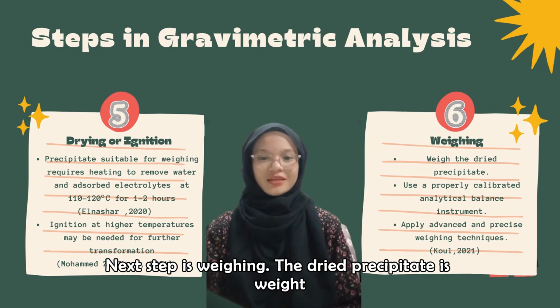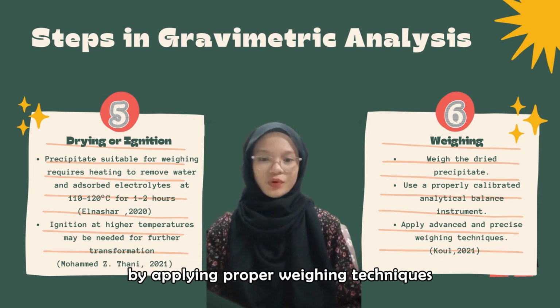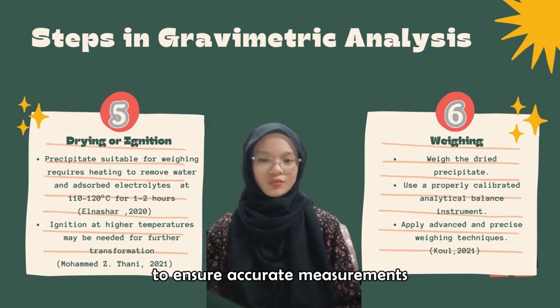Next step is weighing. The dried precipitate is weighed using a calibrated analytical balance, applying proper weighing techniques to ensure accurate measurements.